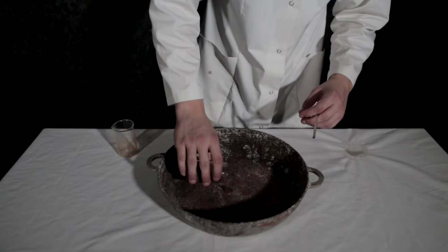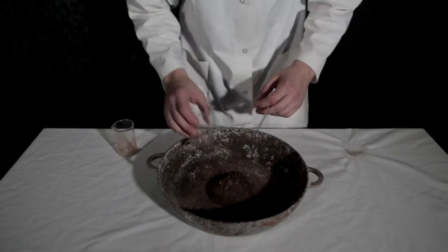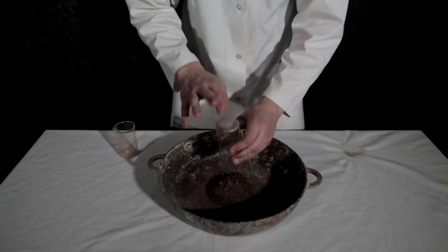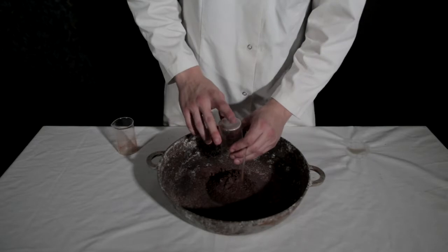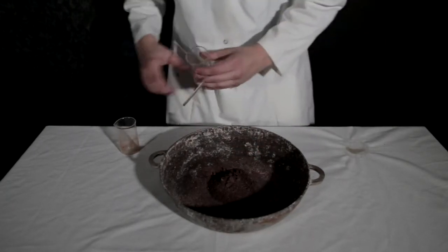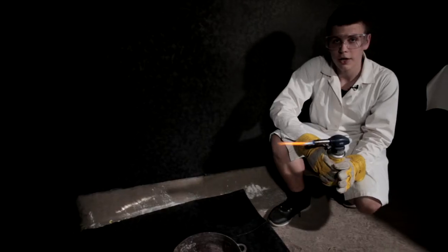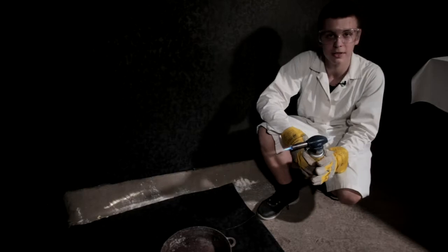So I'll put it right here, like so. And the next thing we are going to do is to light up this mixture with the burner. Okay, so I'm going to light it up. So let's see what happens.